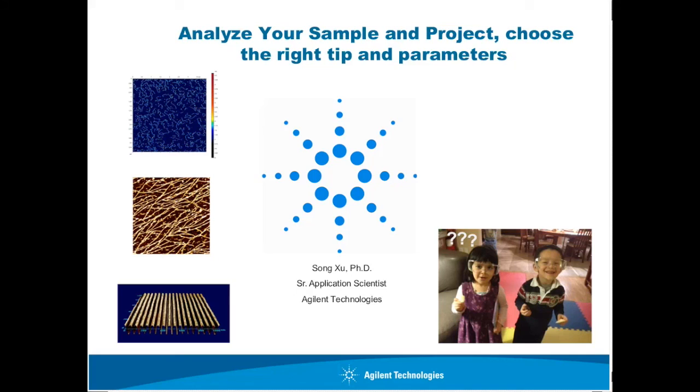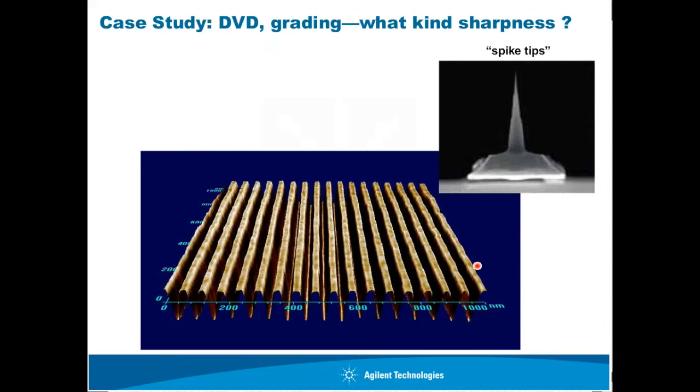Okay. In the case of imaging the grating with very high aspect ratio tips, how do you handle the lateral attractive forces between the tip and sample? That is a very interesting question. I do have lots of problems with lateral attractive force. In this case, for example, this particular sample, I actually waste one tip every sample.